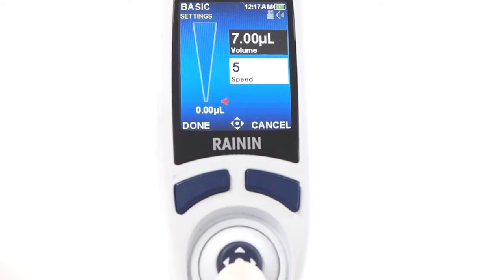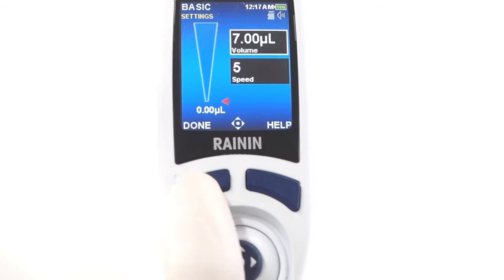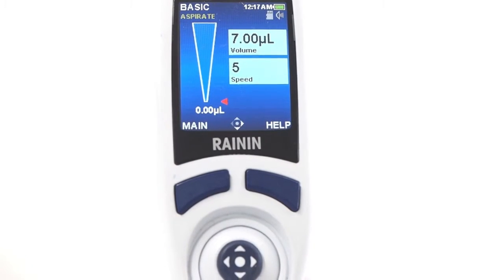When all values look good, press done to exit settings. Tap the joystick up to aspirate. Tap it down to dispense.